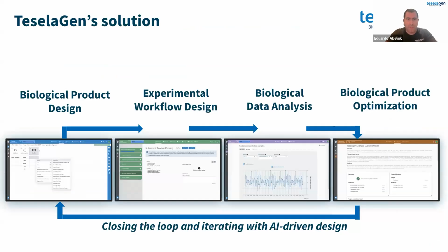That's exactly why at Teselagen, we've built the next generation platform for biological R&D. It's one that is really reimagining how biological products are designed, built, and optimized. Our platform brings structure and intelligence to the entire development process, and it's organized into 4 powerful modules, each focused on a key phase of innovation.